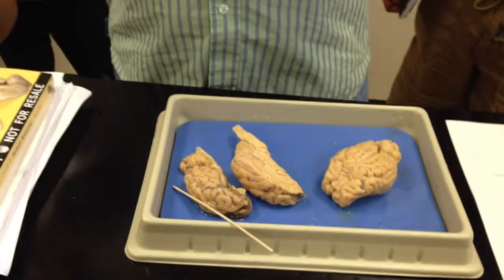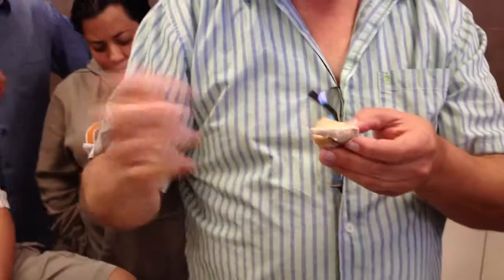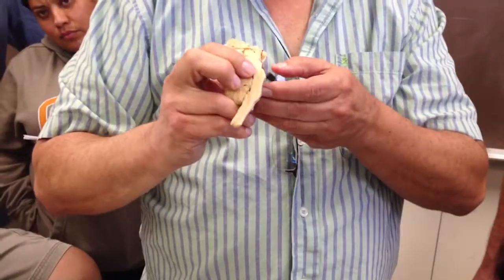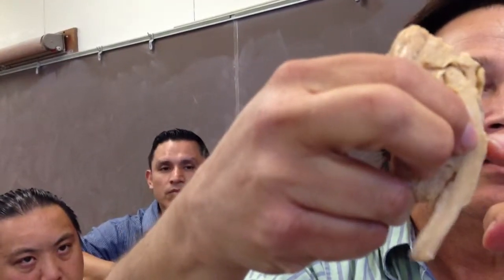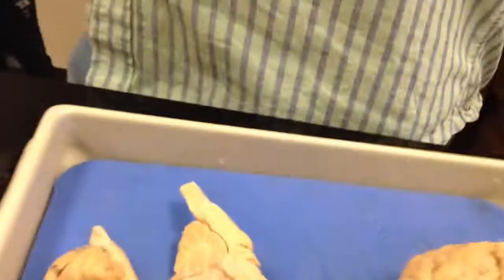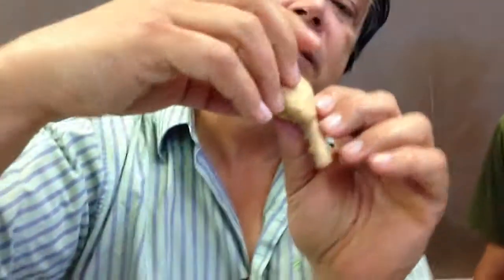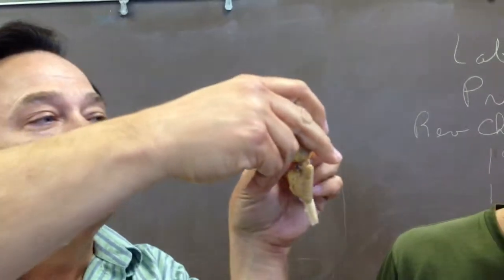So, then the brainstem. The brainstem has 3 parts, right? There's the medulla, the pons, and the midbrain. I told you the best thing to do is sort of spot that little bulge there. That's the pons. Where is it? In front of my finger. That little bulge is the pons. So that tells you that beneath it, there's the medulla. And past it, up here, that's the mesencephalon.